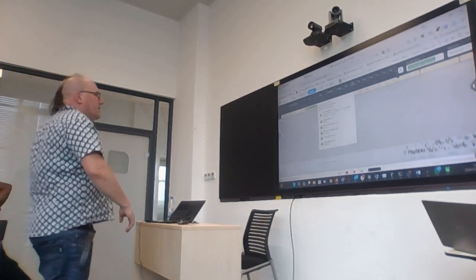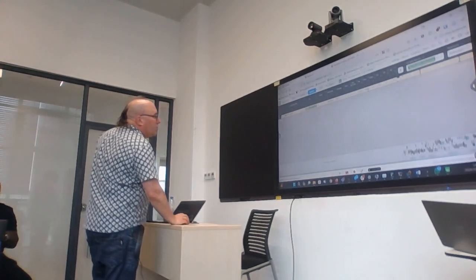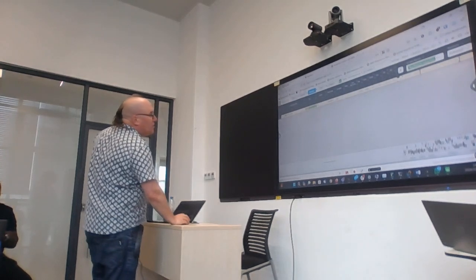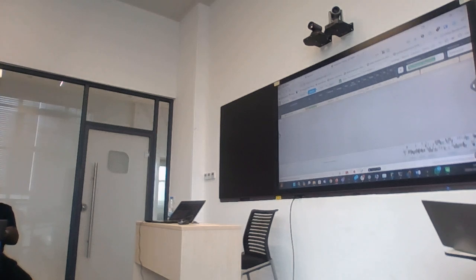We have got, according to the quality control, 93% of the genome. To me, 93% of a 200 kilobase genome, that's quite a lot. Okay? That's quite a lot.